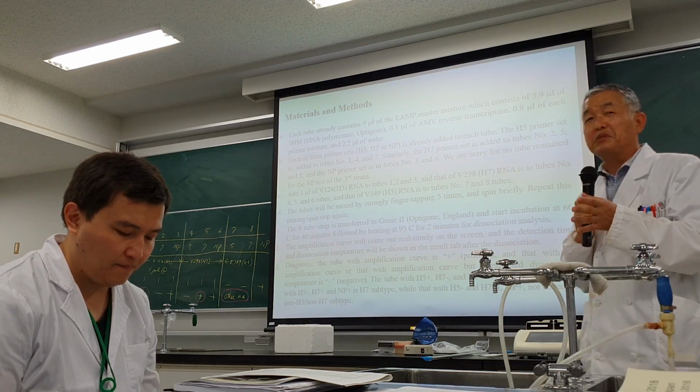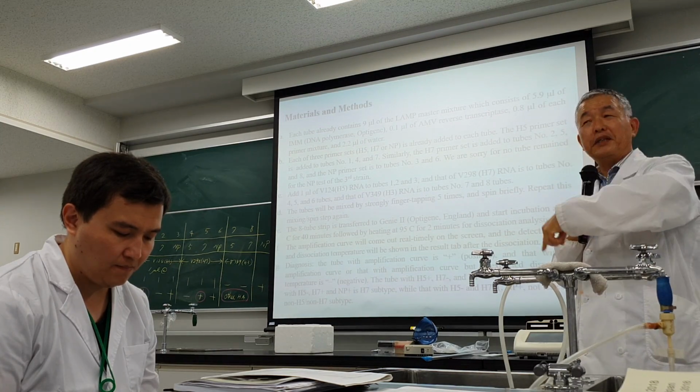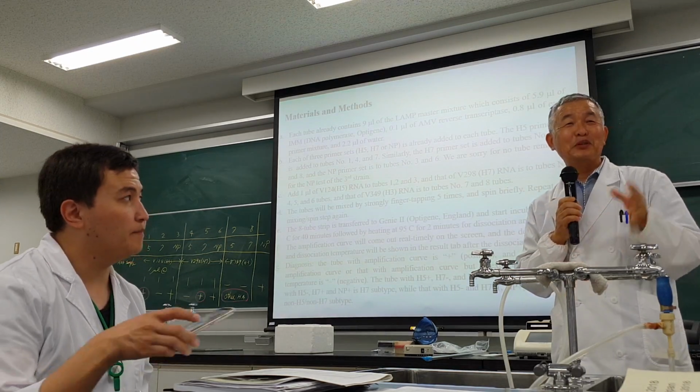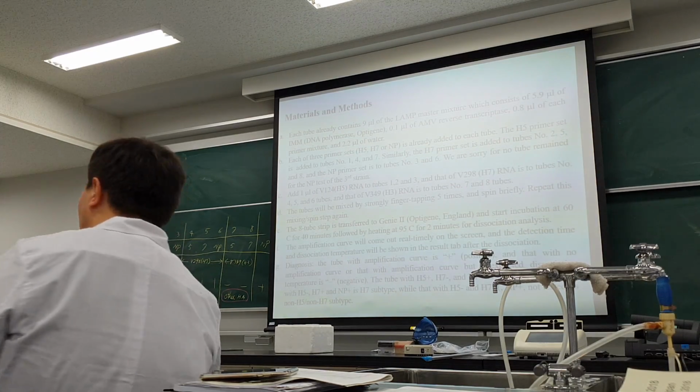Alright, anyway, the experiment is very simple. Add, cap, lock, same, and then mixing, spin, start incubation. That's it. Very simple, no need to consider. Okay.